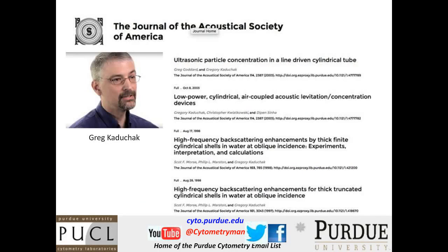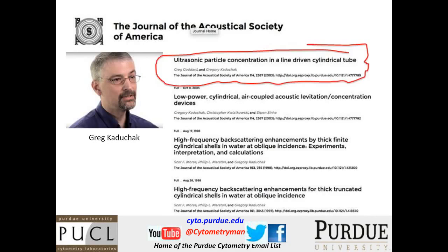And it turns out that a few years ago, Greg Kaduchak published a paper in this same journal. And that paper was entitled Ultrasonic Particle Concentration in a Line-Driven Cylindrical Tube. Naturally, all of you would have searched out this paper and reviewed it and read it and would have fully understood it.